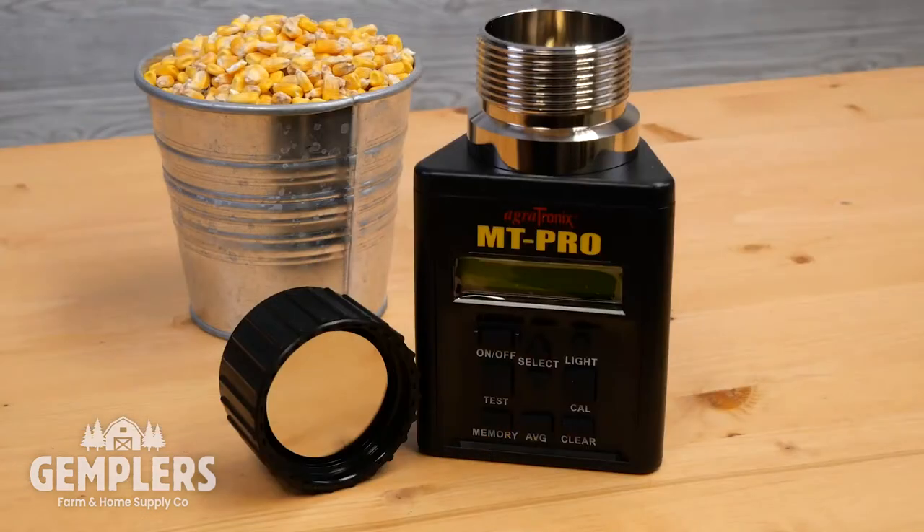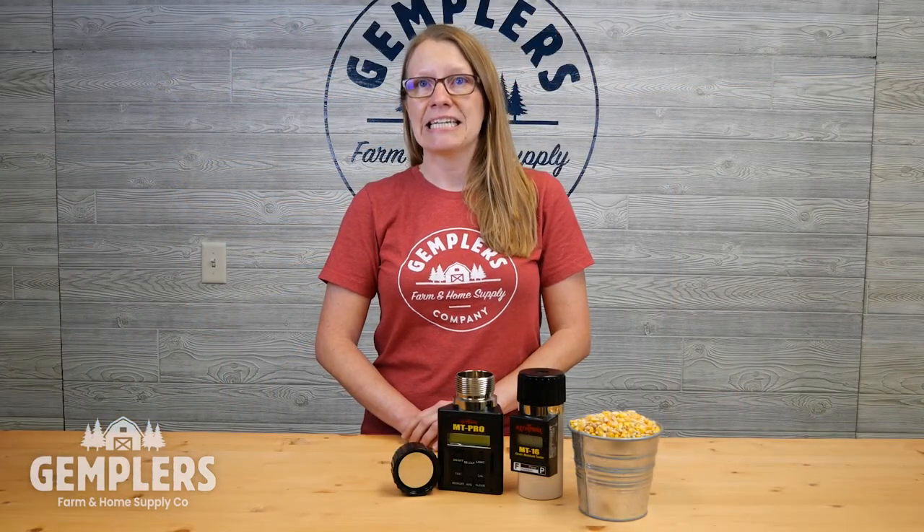The Agritronics MT Pro features 40 different grain scales. It includes scales for the more common grains like the MT16 has, along with some others such as buckwheat, clover, fescue, mustard, peanuts, and popcorn. Repeatability and accuracy is again plus or minus 0.5 percent in normal moisture range for stored grain. The MT Pro can average up to 20 readings, automatically compensates for temperature, and can also be adjusted to more closely match the readings from your local elevator.